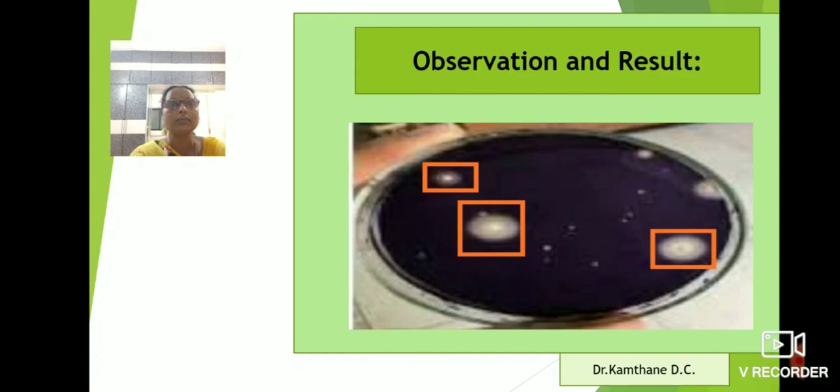This is the observation and result that is the organisms which are able to produce amylase enzyme. These are showing the zone of clearance around themselves while rest of the agar appears violet in color.